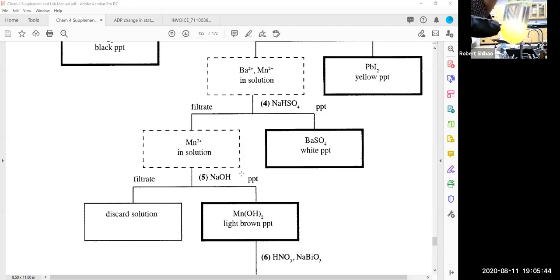And so this is good. Do you see the precipitates on the bottom? So I could see the colorless solution on the top. And so what I'm going to do is I'm going to watch the colorless solution as I drop the potassium iodide in there. If I get more cloudiness, that tells me I haven't completely precipitated it. In this case, more cloudiness developed, and therefore there's still lead. I need to get all the lead out of the solution and into the precipitate. So I'm going to just keep adding the iodide basically until I stop seeing precipitate being formed.